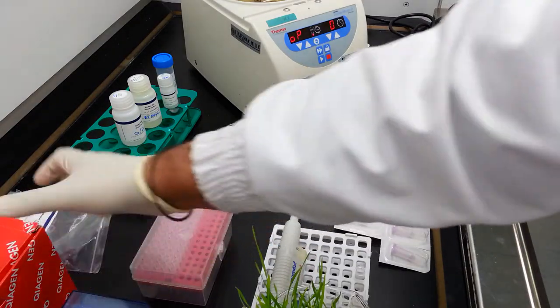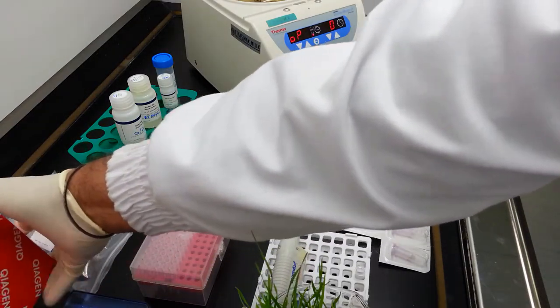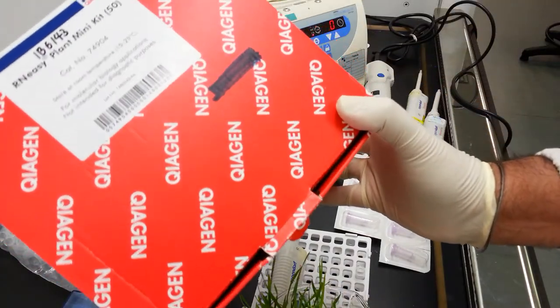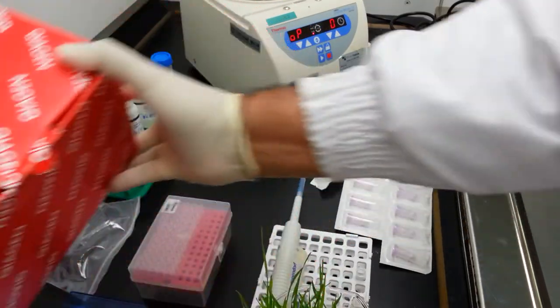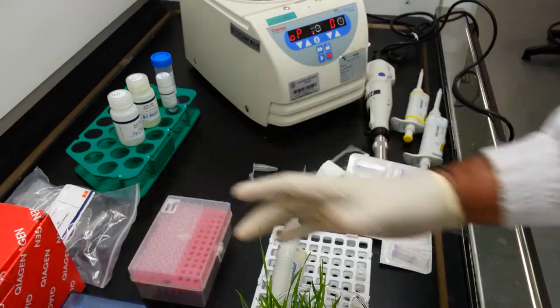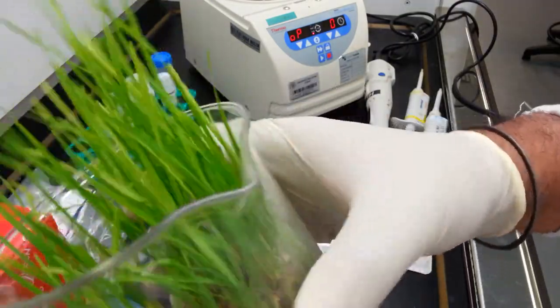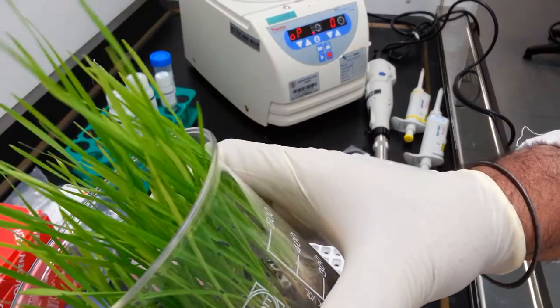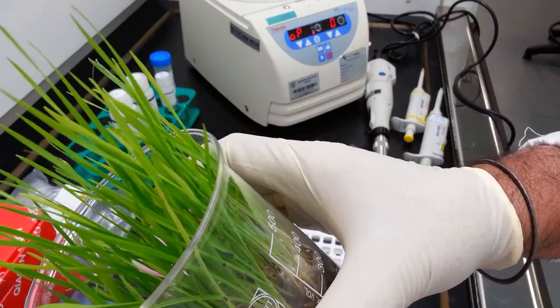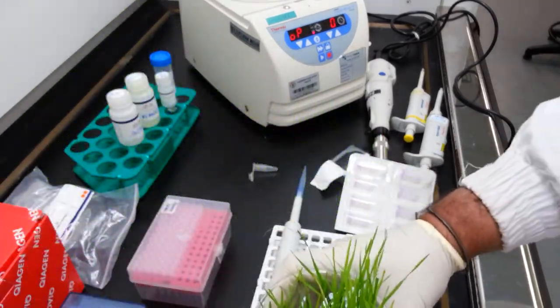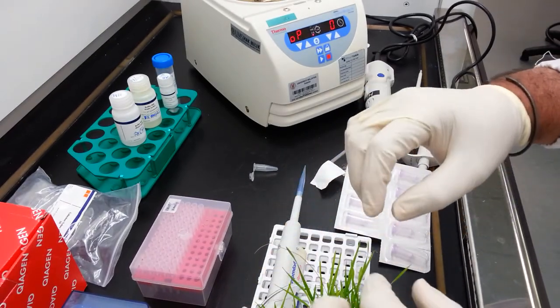Today's laboratory session will focus on the usage of the RNAeasy plant mini-kit for the extraction of RNA from these wheatgrass samples. We have specifically chosen this plant because it yields extremely high amounts of RNA during the germinating phase.